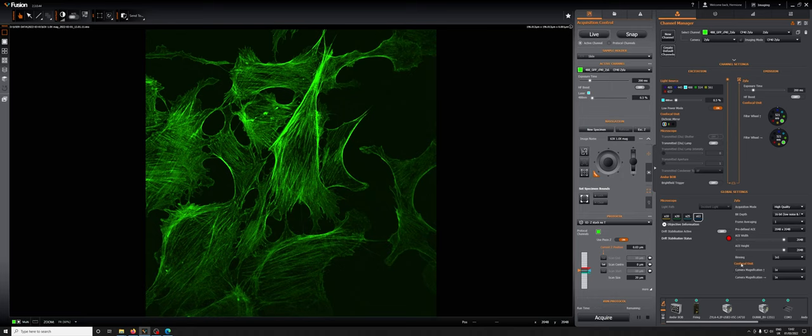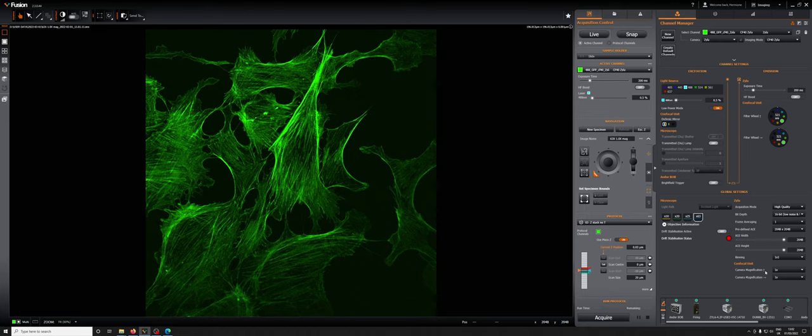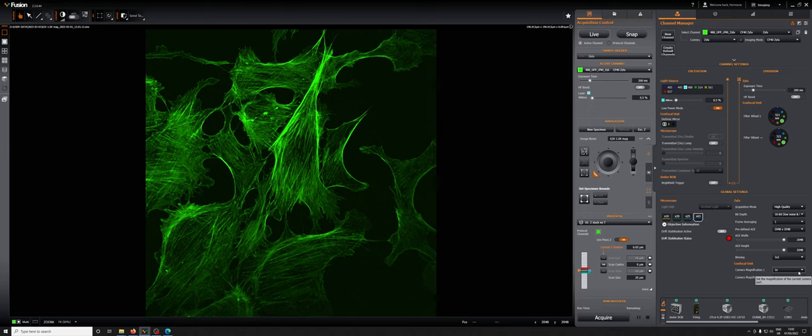You can see there's a section in the global settings inside the channel manager in the channel section which has camera magnification with an arrow pointing up and camera magnification with an arrow pointing sideways. These are the places where we can increase the magnification lens on the way to one or the other camera.